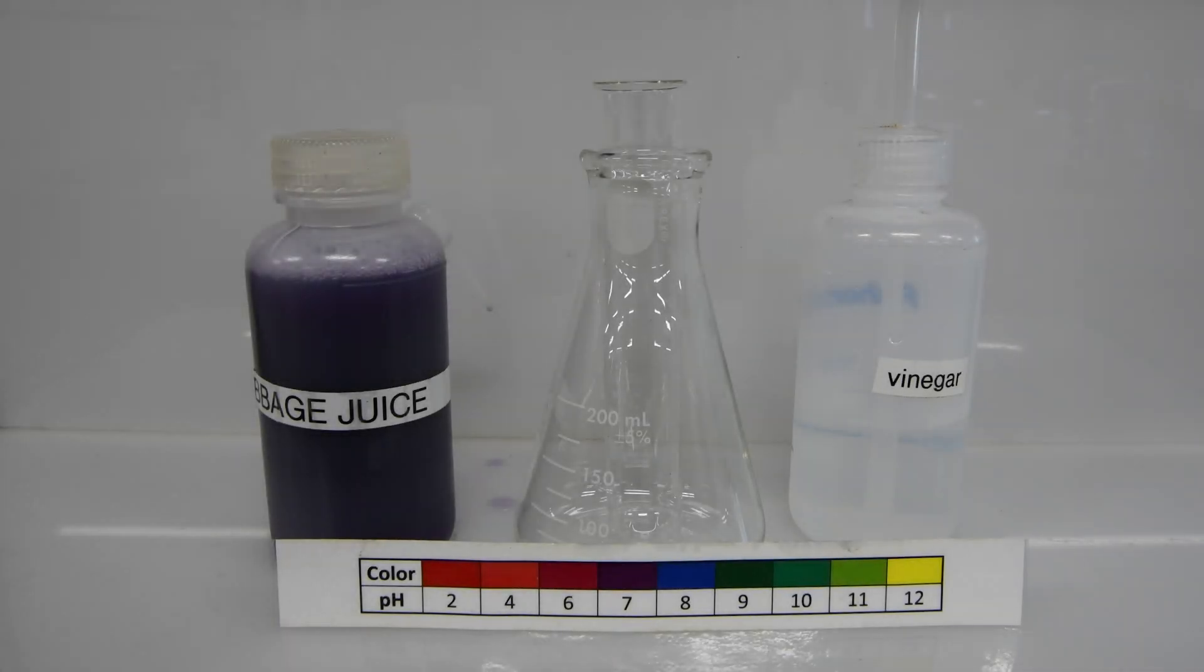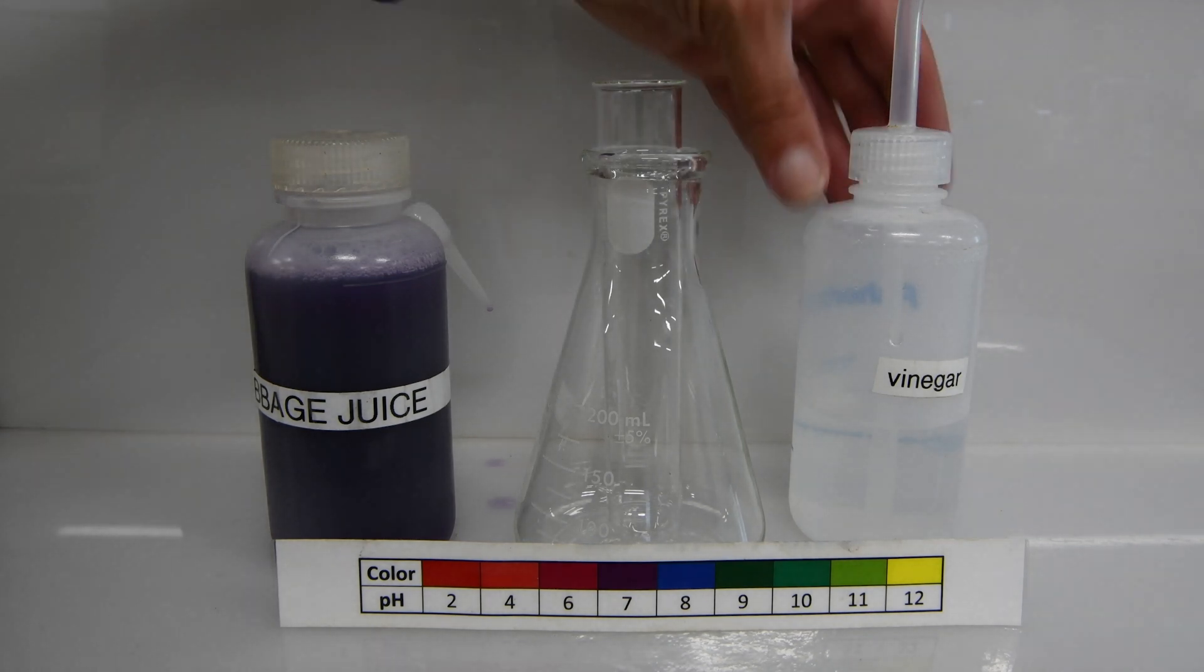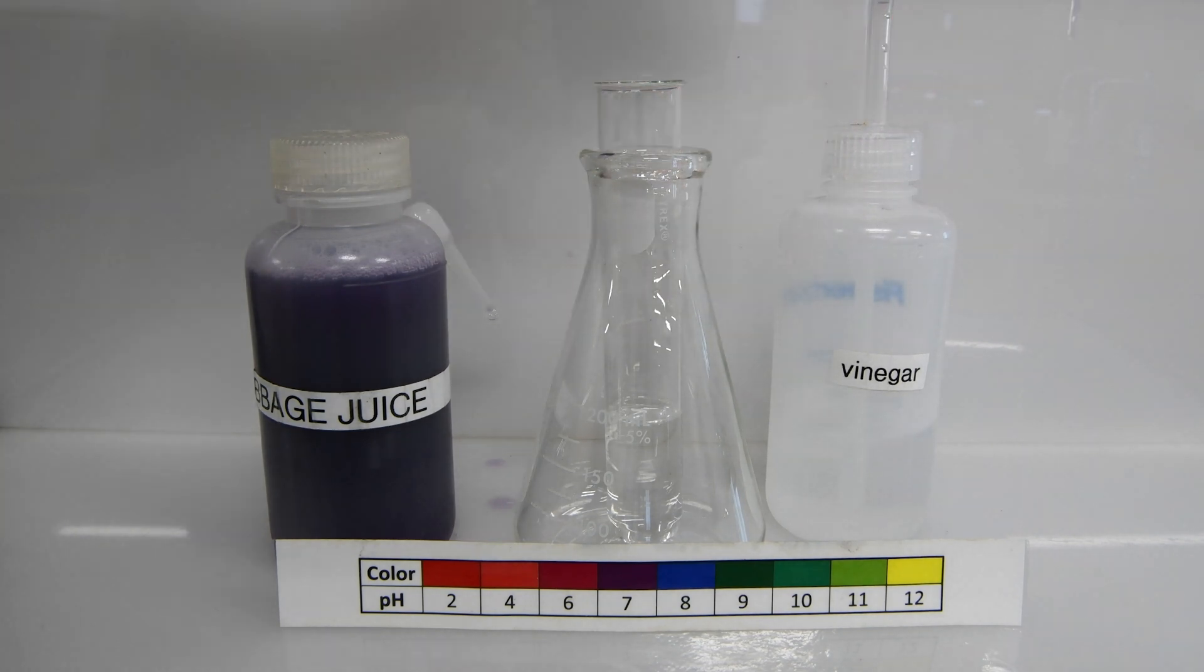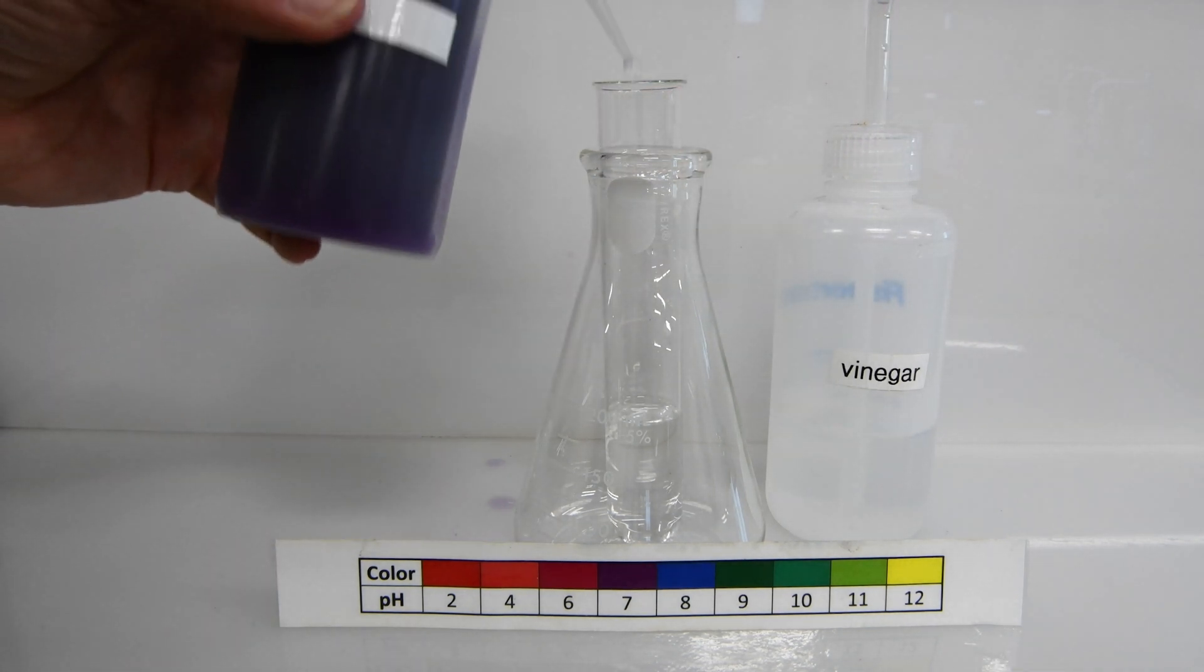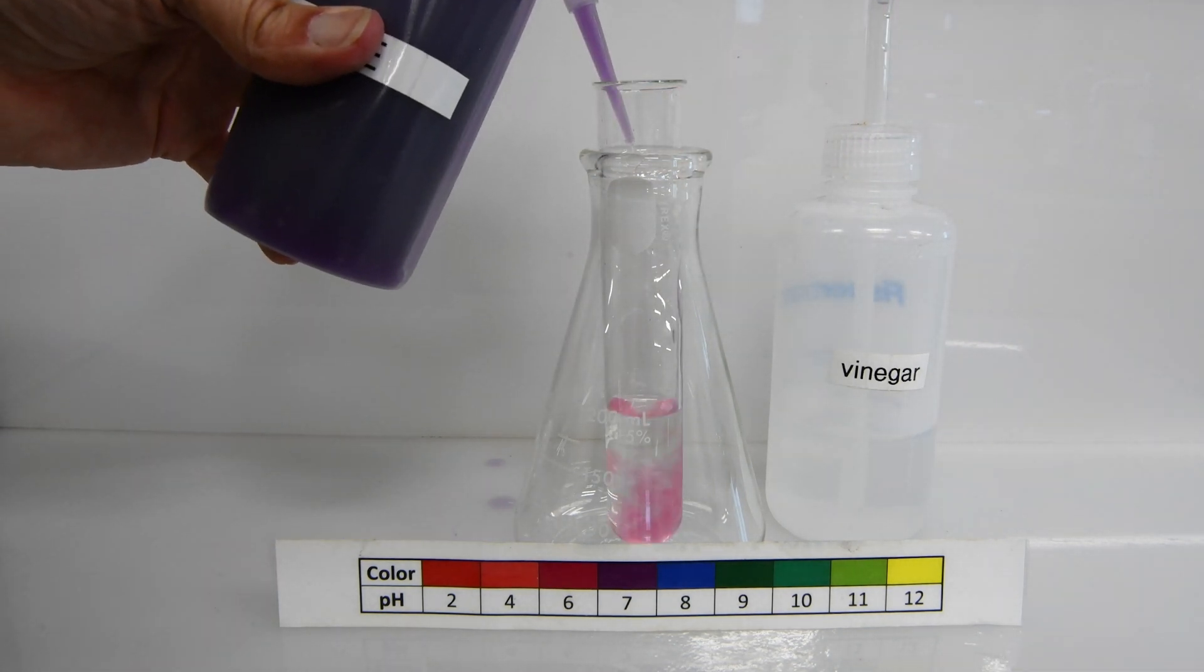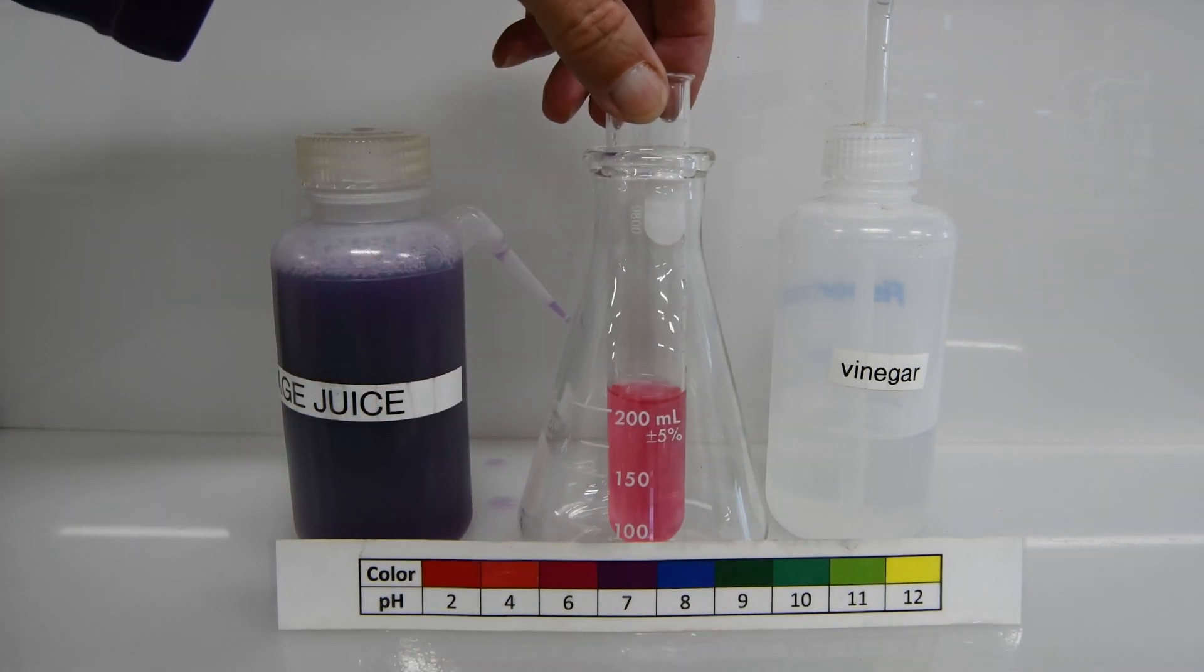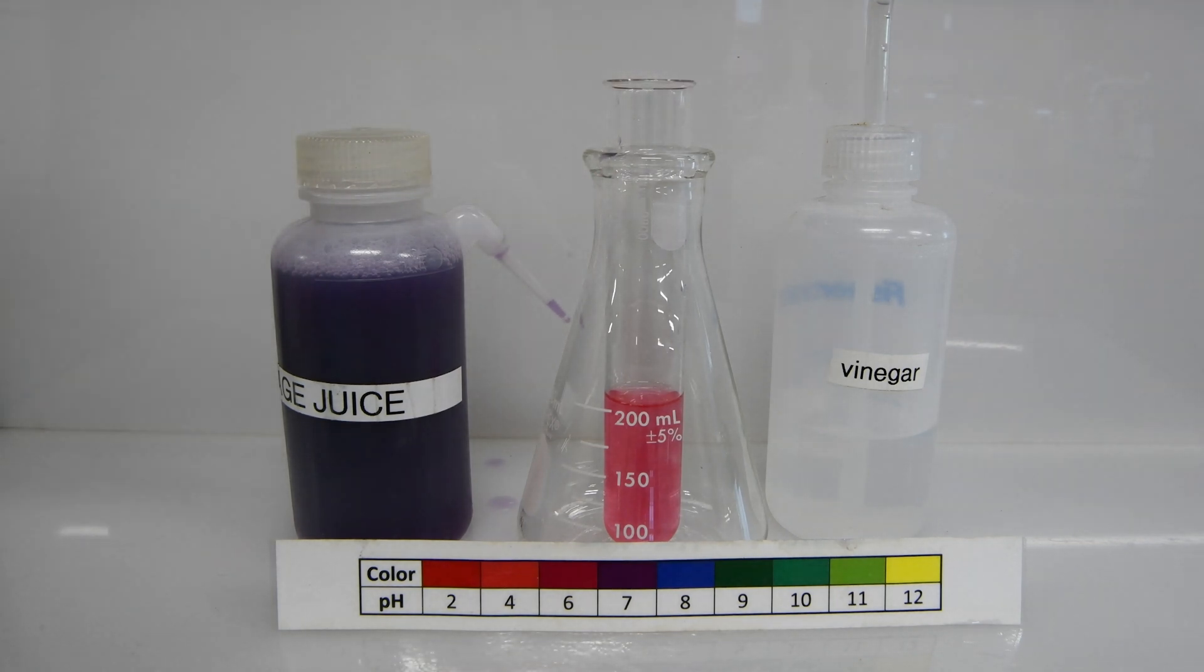Next let's take a look at vinegar. So we'll add a sample of vinegar to our test tube. And then a squirt of cabbage juice. And it looks like we're getting a lovely red color again. So use the color chart and come up with your best estimate for the pH.